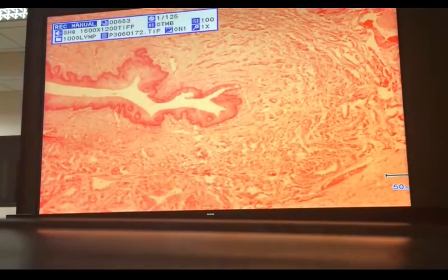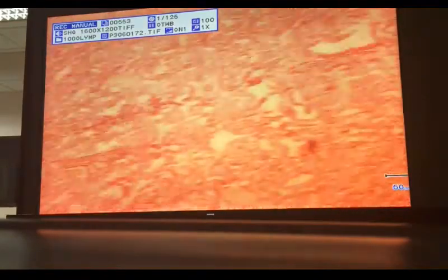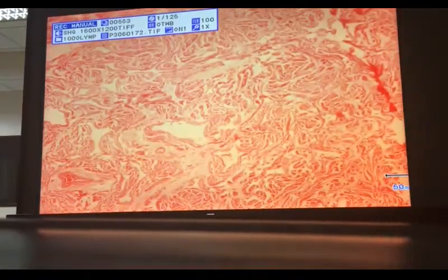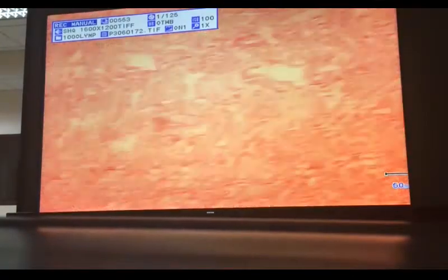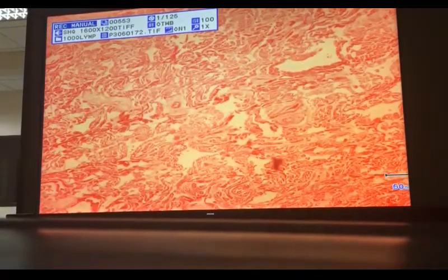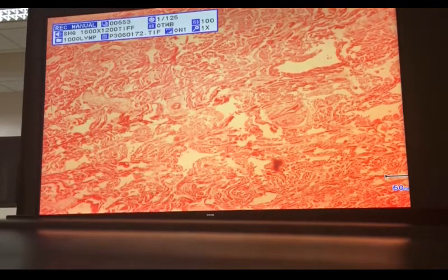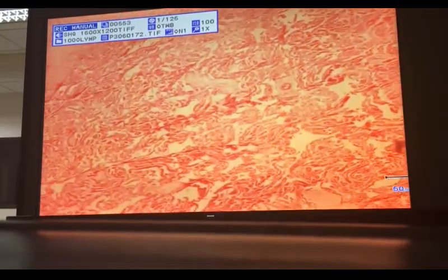Okay. We're now looking at the histology of the penis. What is responsible for the erection of the penis? Erectile cavernous bodies. Vascular, filling of blood. Cavernous bodies. Now, the cavernous bodies are actually composed of what structures?